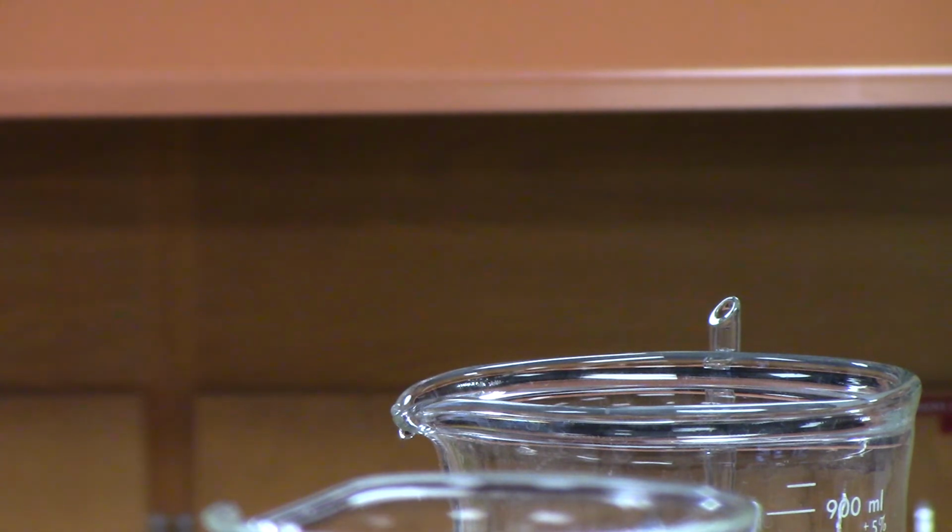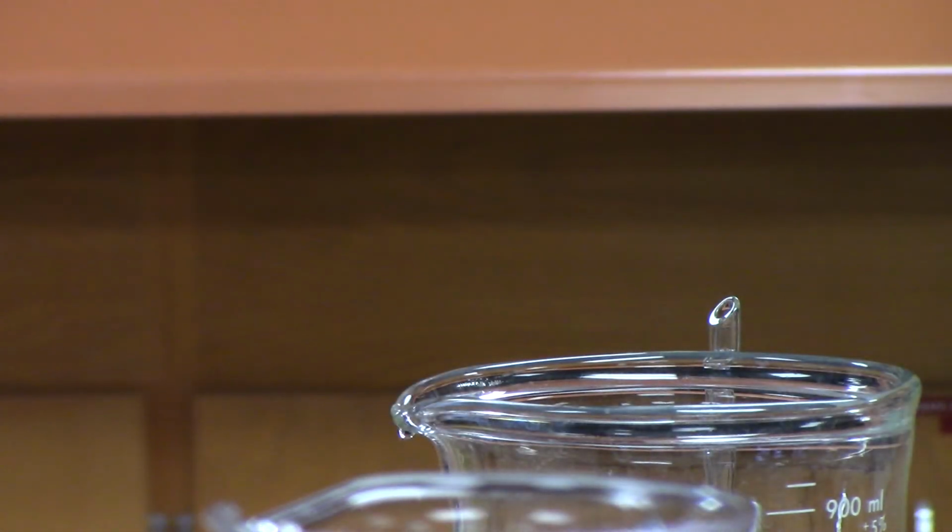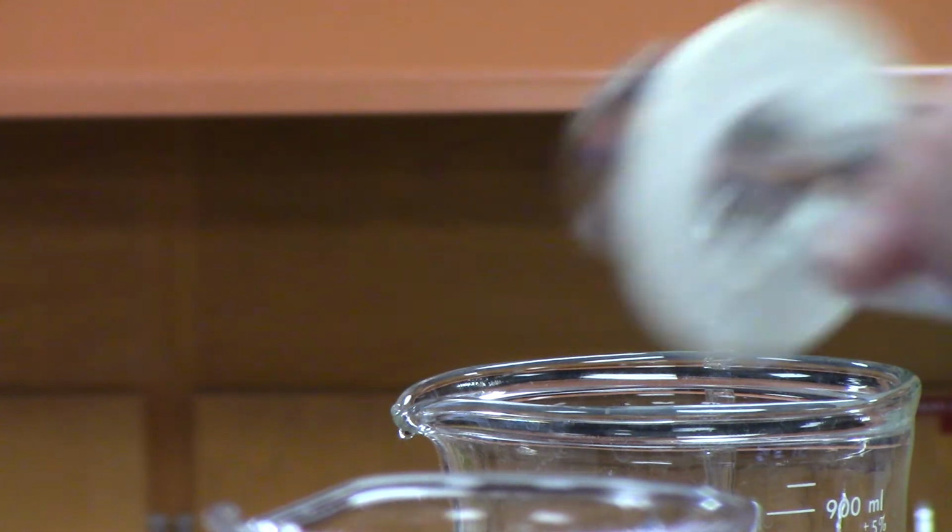Okay, all right. So I mixed it up, and then I added it to my beaker. I added it to a graduated cylinder just to see if it gets close to 25 on the graduated cylinder. I didn't have to do that, but I did, so I got to rinse out my graduated cylinder as well as my pipette.